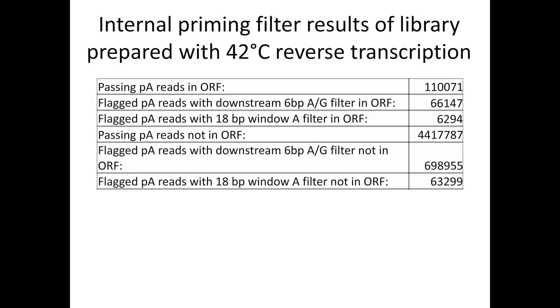So if we look at the reads that we're actually mapping to within open reading frame regions, we notice that many of these reads were likely internal mispriming events. And so this filter actually removes almost half of these reads, so 66,000 are removed, and the remaining 110,000 could represent real internal polyadenylation events, and then the other filter removes only 6,000.